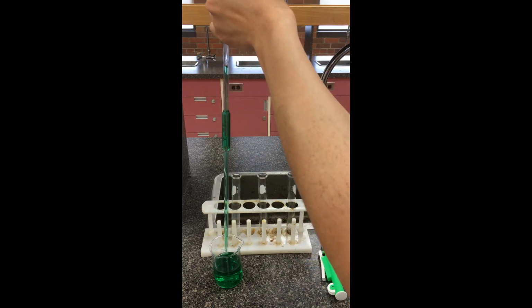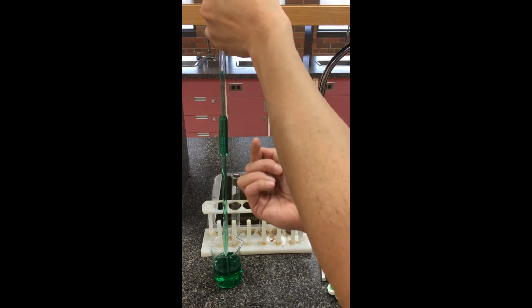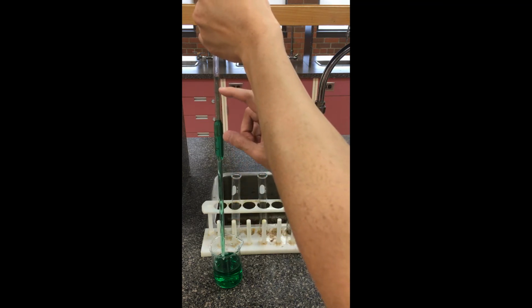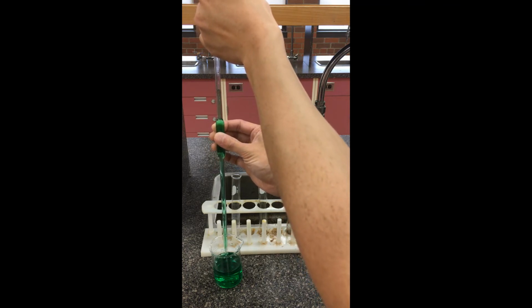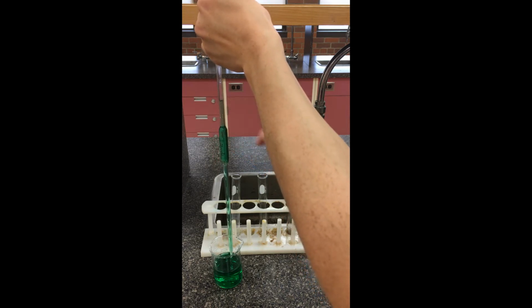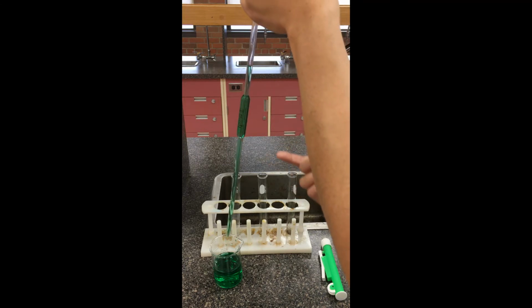As you wiggle your finger, if you use your other hand, you can start twisting the pipette. Sometimes that extra adhesion helps the solution drop down a little bit, not as quickly, and that way we can have a better aim for that line. So here I go, I'm just going to wiggle that thumb back and forth. When I'm confident that I'm at the line, at the bottom of the meniscus, I'm just going to seal it tight. And there we go, we have exactly calibrated for 10.00.